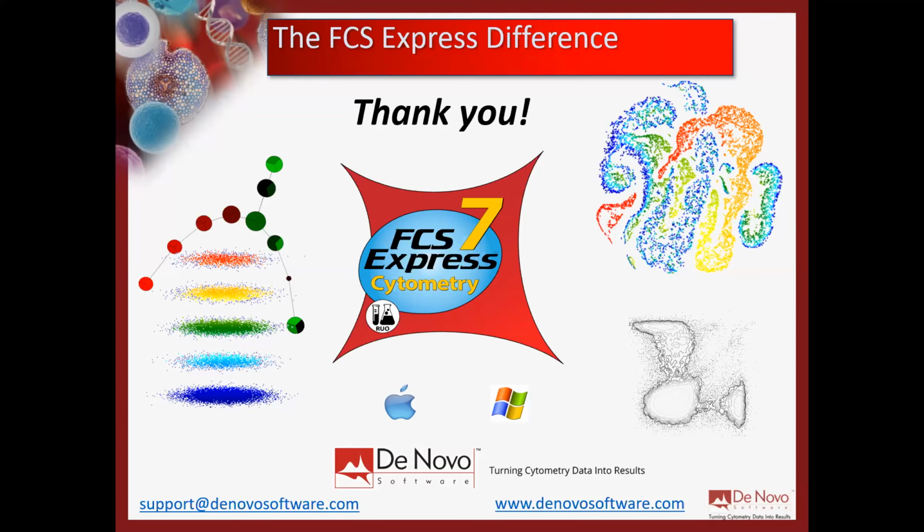One question I usually get, right, is how do we access FCS Express at the flow cytometry core facility at Sloan Kettering? You can visit the MSKCC FCCF webpage. You can search that in Google. You can access that through the intranet at MSKCC. They have information up there about how to access the license.